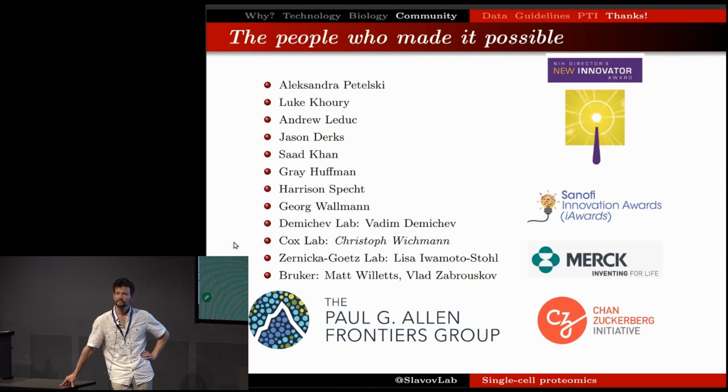Great talk, Nikolai. Thank you so much for presenting this work. I want to ask, from a single mammalian cell, how many proteins with more than 2 unique peptides have you been able to consistently identify? It very much depends on the mammalian cell, the method for analysis used, and the technology. If we are to maximize that number, I think it's about 4,000 from a HeLa cell. A HeLa cell is not a particularly interesting cell to analyze, right? So if we go down to analyze primary cells, that number is much lower.